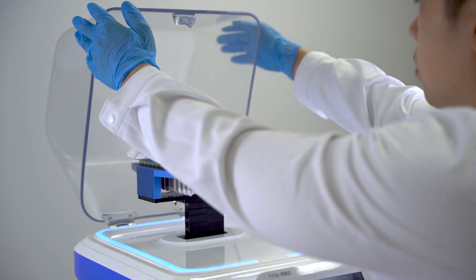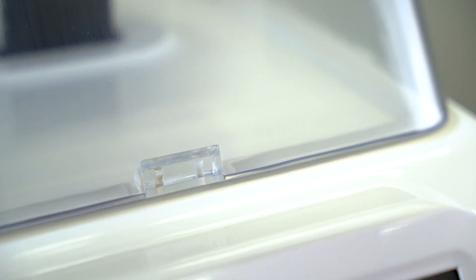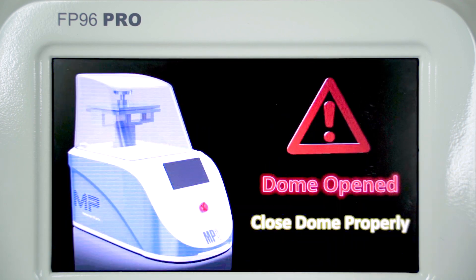Slowly close the dome, ensuring that the electromechanical lock clicks into place for safety. A warning message will pop up if the dome isn't securely closed.